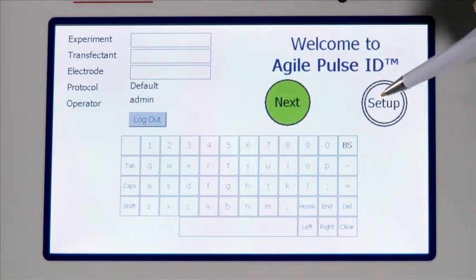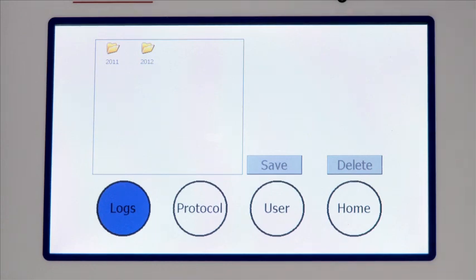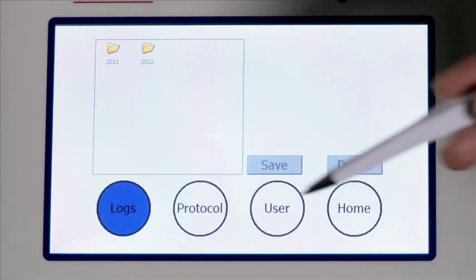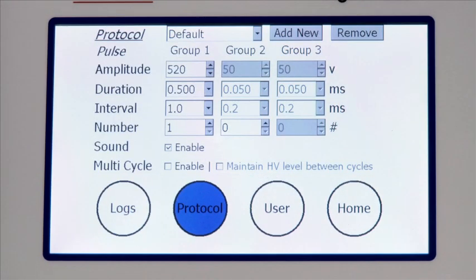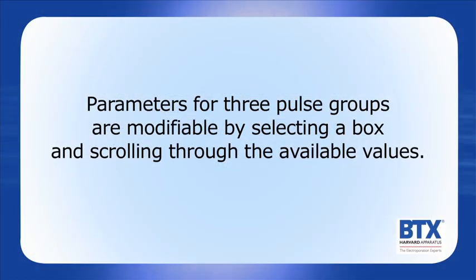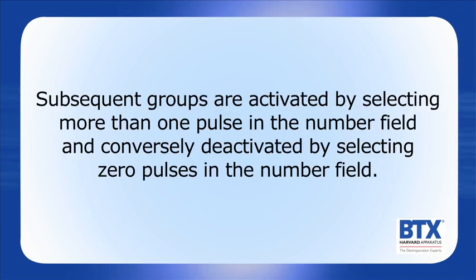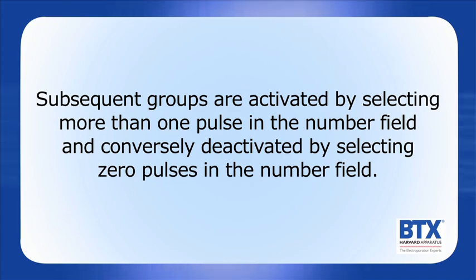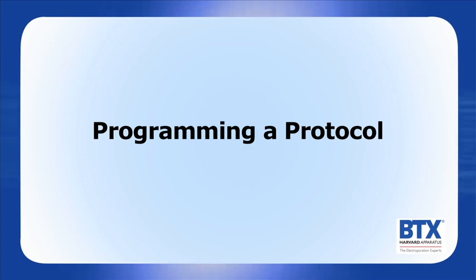To set up a protocol, click on Setup, then on the next screen click Protocol. Parameters for three pulse groups are modifiable by selecting a box and scrolling through the available values. Subsequent groups are activated by selecting more than one pulse in the number field, and conversely deactivated by selecting zero pulses in the number field. The protocol can be named and saved in the protocol logs.